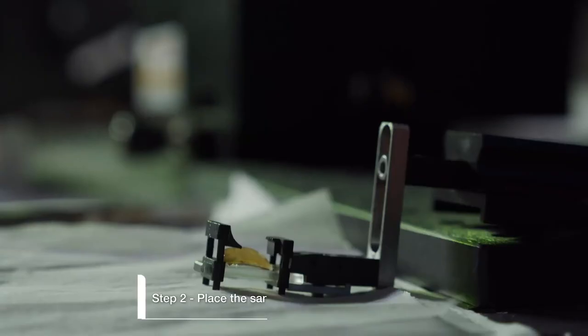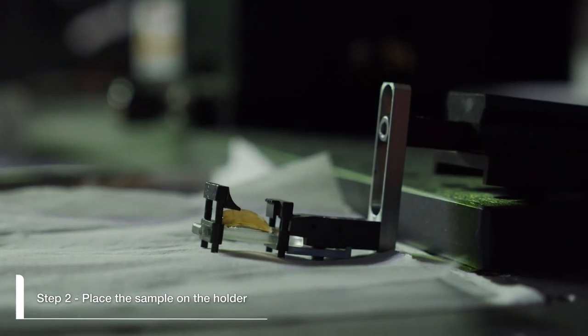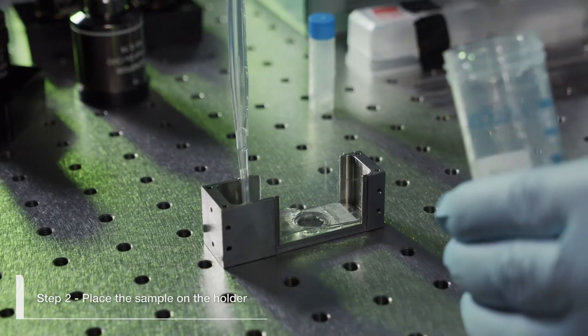Step 2. Place the sample on the holder and put it into the small or large chamber.